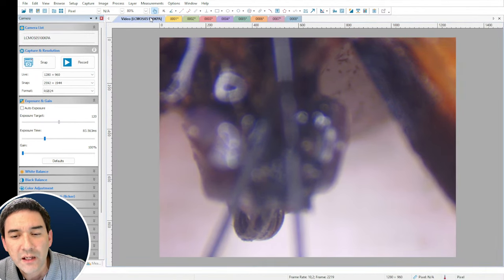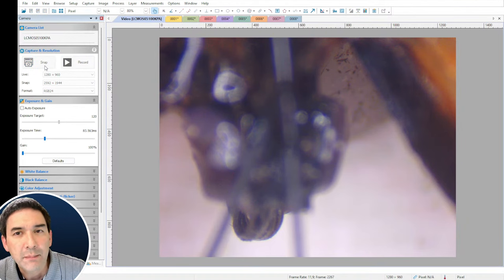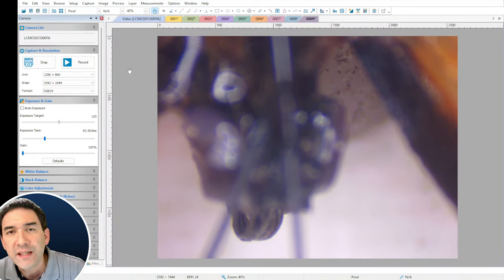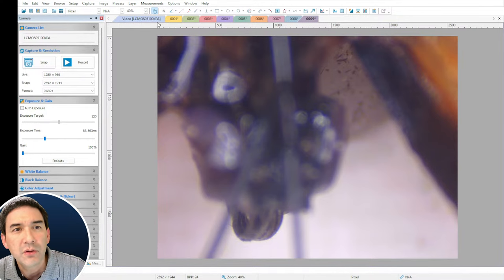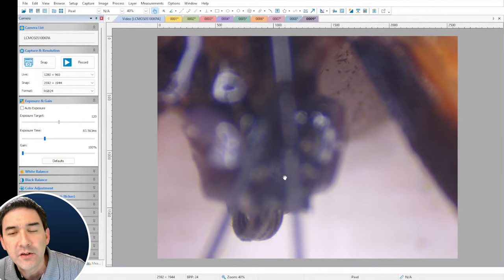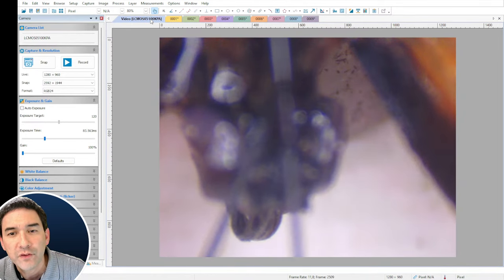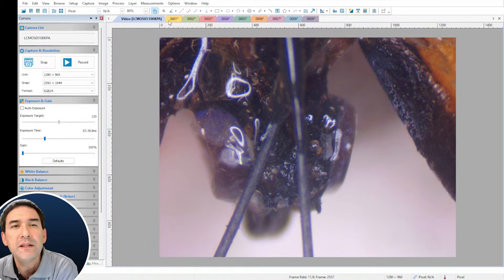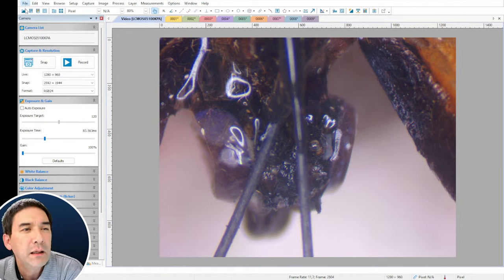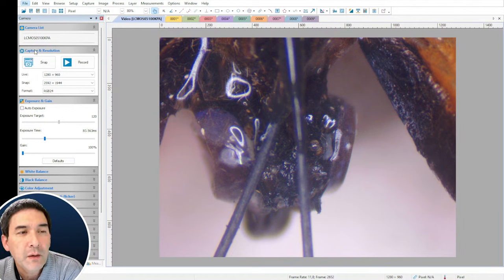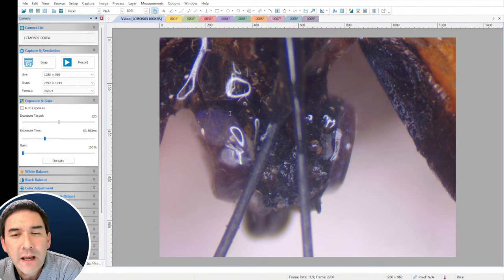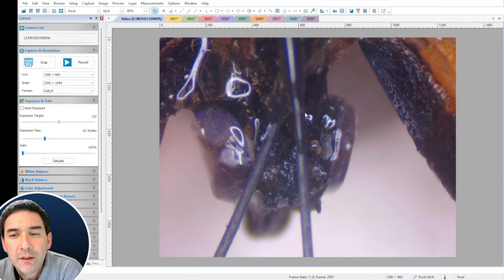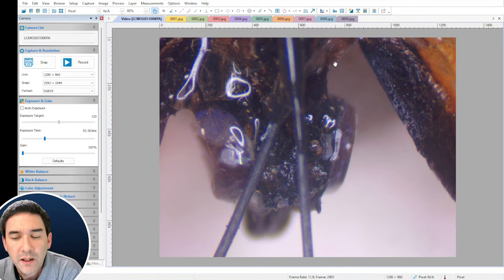Now the bottom part is quite in focus. I've taken nine pictures and need to save them consecutively. I always had to go back to the camera because when you're looking at a picture and change focus, you don't see it change since it's a different tab. I go to File > Batch Save — it will save in the capture TubeView folder as a JPEG sequence, automatically numbered. All nine pictures are now saved to my hard disk.